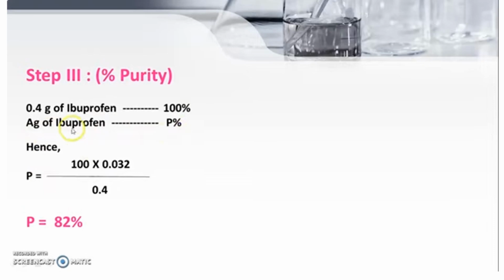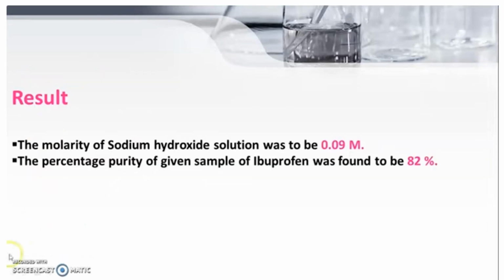If it is in range of this number, your experiment is almost error-free. Otherwise, if this result is far from the range of the monograph, your experiment is error-prone. Therefore, you have to modify and redo the experiment to minimize the error.